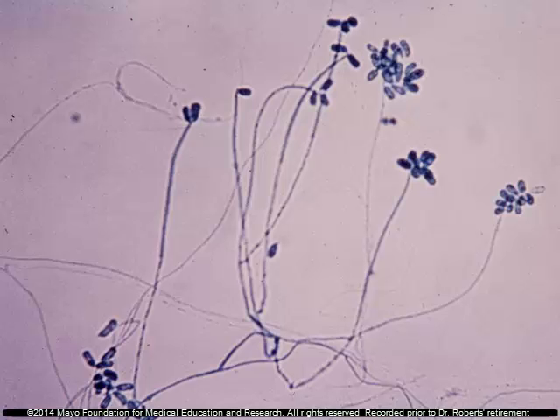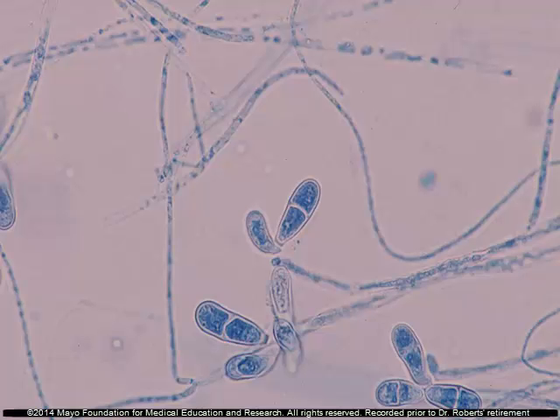These are the spores of Trichothecium. They're a little bit dark and just not quite crisp in terms of being able to see them. But the spores are elongated, and they're divided in two, and they come off one side then the other, one side then the other. And it's one that's easy to recognize. And there you see the spores much better. Two-celled, and they come off in a zigzag fashion.